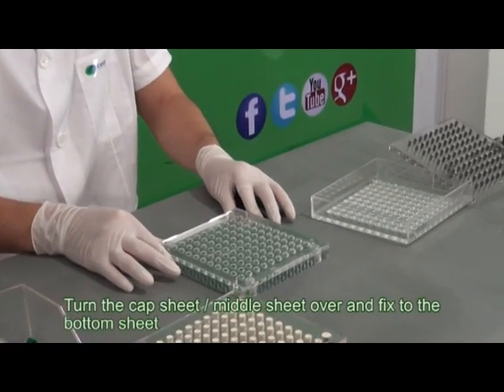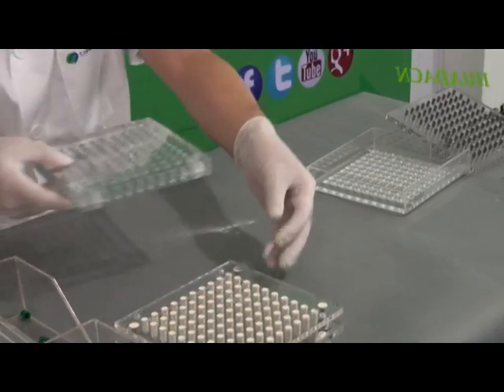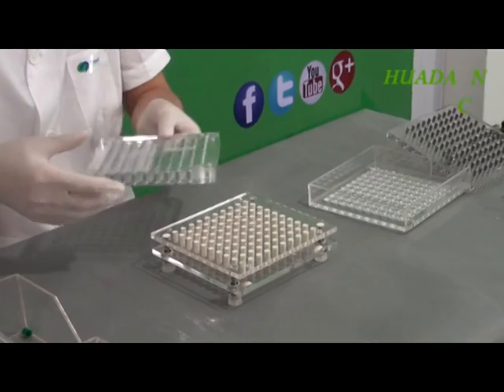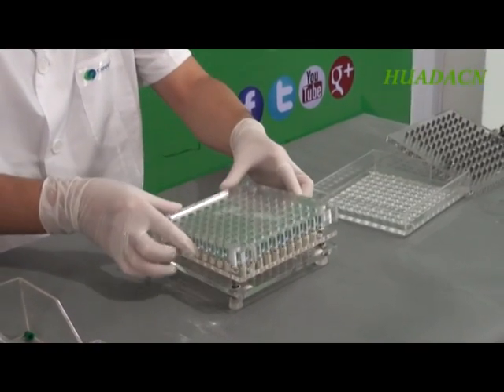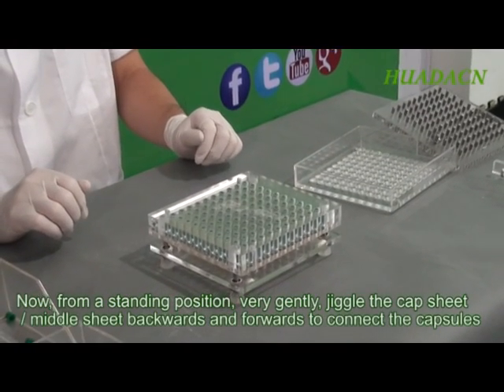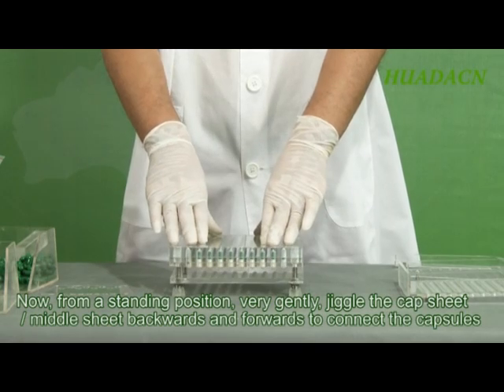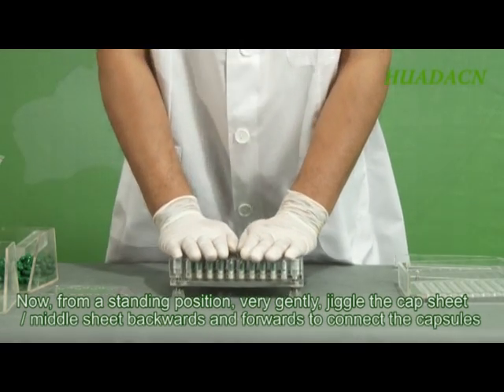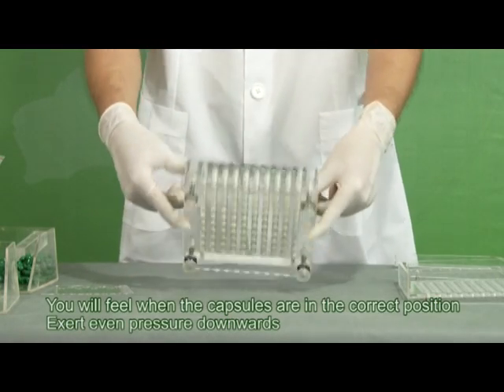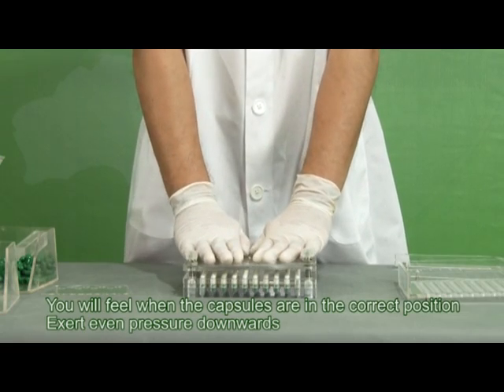Turn the cap sheet and middle sheet over and fix to the bottom sheet. Now, from a standing position, very gently jiggle the cap sheet and middle sheet backwards and forwards to connect the capsules. You will feel when the capsules are in the correct position. Exert even pressure downwards.